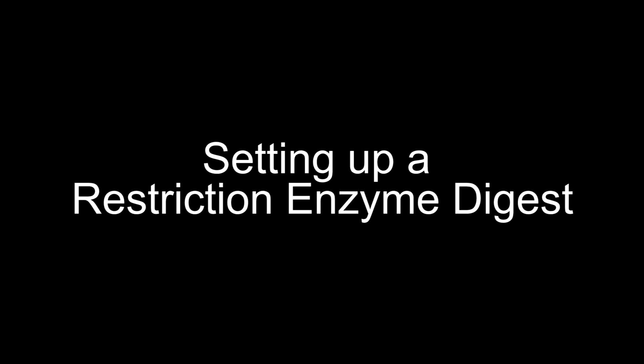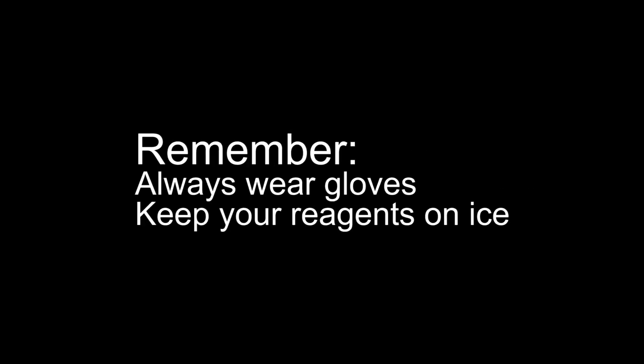Setting up a restriction enzyme digest. Always wear gloves to avoid contamination and keep your reagents on ice.